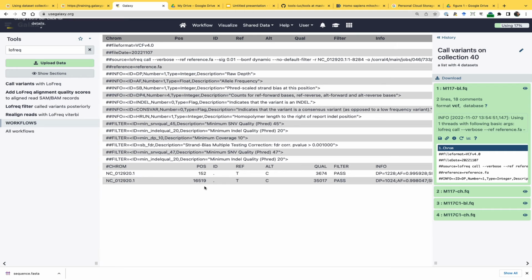So now imagine we did it on 1,000 samples. So you're going to get 1,000 data sets like this. And this is VCF data. It's good for some things. For example, it's good if you're going to feed these variants to some downstream workflows for recalibration, and there are many tools which accept VCF. But in this analysis, I just want to know, do I have any differences between child and mother? That's all I want to know.